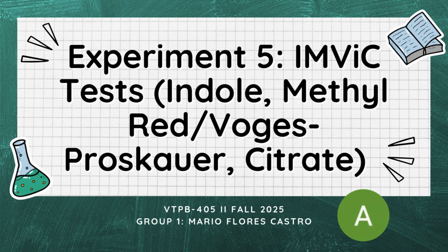Howdy, my name is Adamari de la Cerda, and my partner Mario Flores Castro and I will be discussing our fifth experimental lab report on the IMViC test that includes the indole, methyl red, Voges Proskauer, and citrate tests.